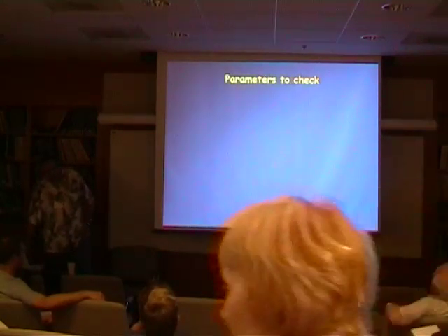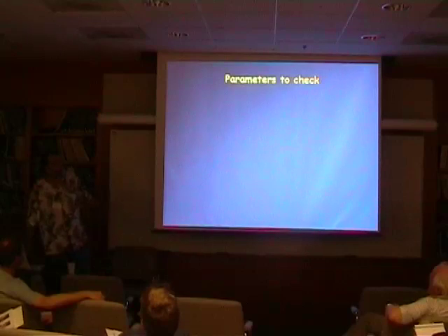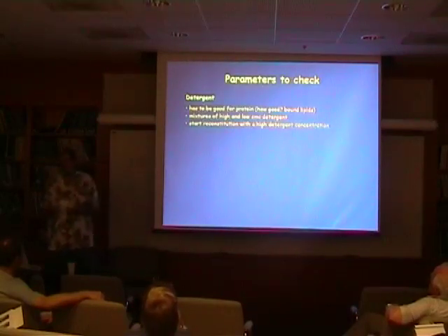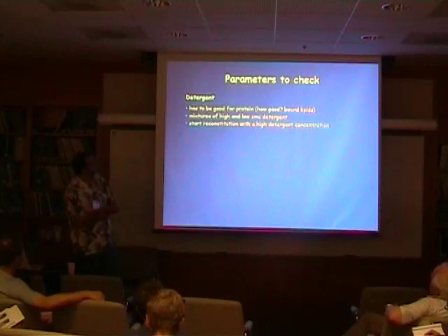And then, so I had a lot more slides, and so this is only now for dialysis. So that's what we are doing in our lab. We mostly, actually almost exclusively, well, we do also monolayer, but mostly for membrane proteins, we do dialysis. And so there are a lot of things, and what is fun, if you talk between different 2D crystal people, it's very hard to actually get them to agree to something, because there's a lot of black magic involved and a lot of beliefs that others don't really see it through.